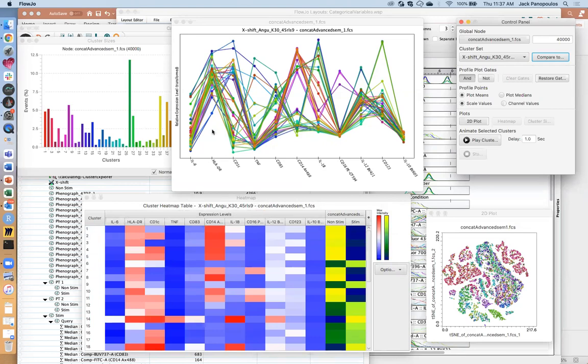I highly encourage you to use those clustering tools to get to this stage where you can see these interesting populations. And who knows, if you see them consistently pop up in your data analysis, it may be worth chasing down in the form of sorting, or perhaps looking at these cells in historic data to see if they crop up there as well. Maybe you have a novel population or a transition state cell that absolutely must exist in order for some downstream outcome to be present.